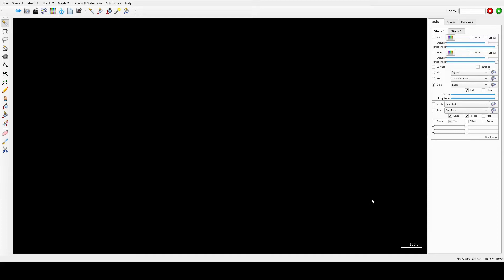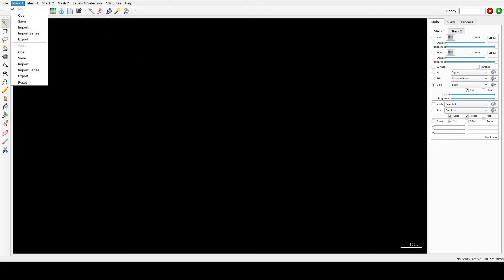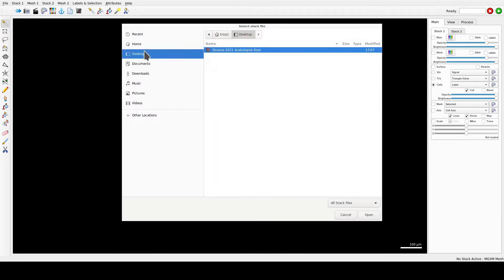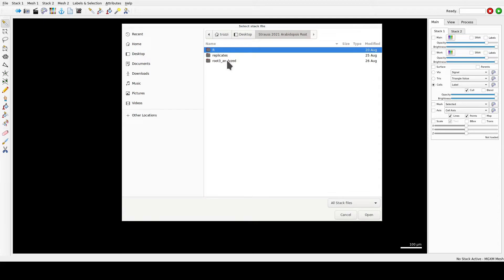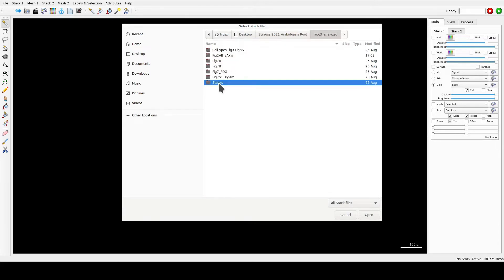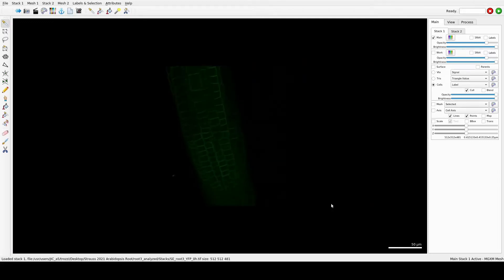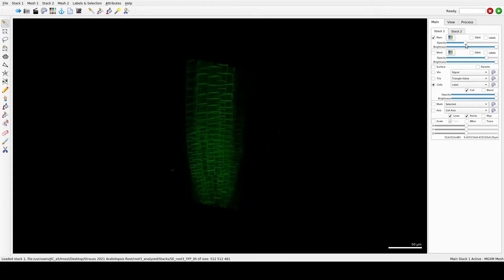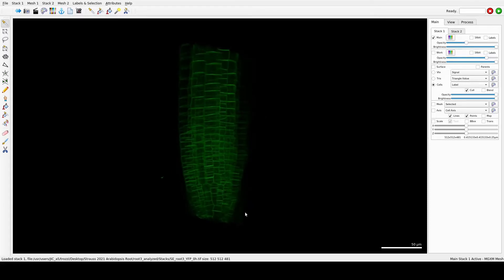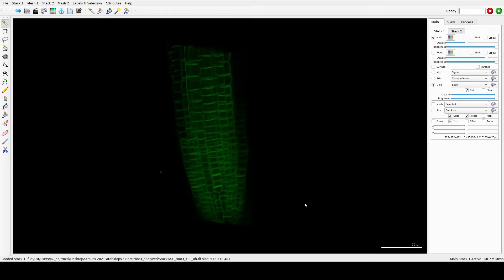I will show you how to generate a mesh with fully 3D samples and how to do the cell segmentation using CNN, which stands for convolutional neural network. The sample we will use is Strauss 2021 Arabidopsis root, and we can open it by going to Stack 1, then open Desktop, Strauss 2021 root 3 analyzed stacks, and select the zero age sample, T0. Here it is — we can decrease the opacity.